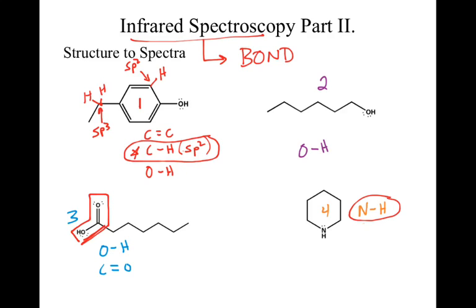The OH in that blue circumstance ends up being at lower wave numbers, just a bar lower than our standard. So we could go through and look for an OH type signal that shows up lower than where we would normally see it in that 3300 range.